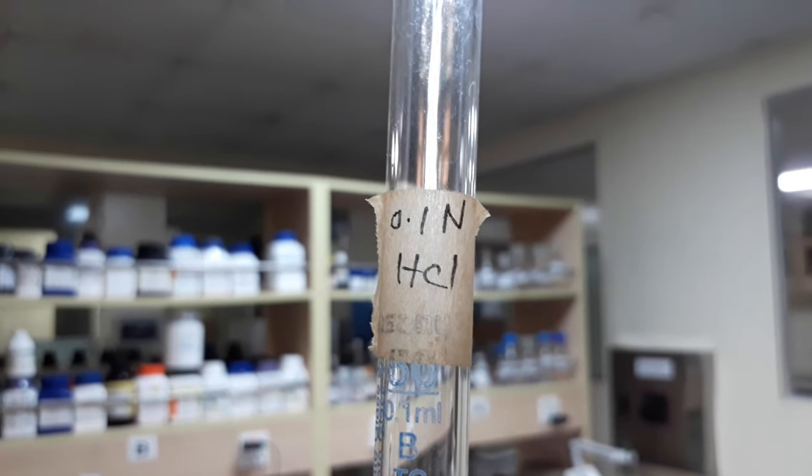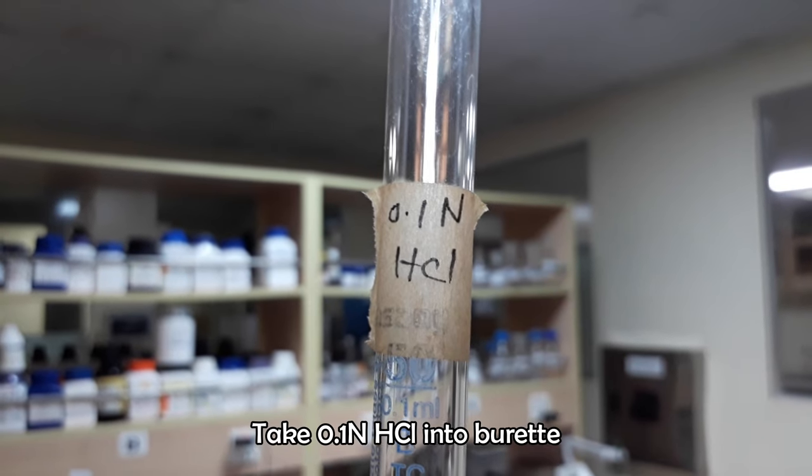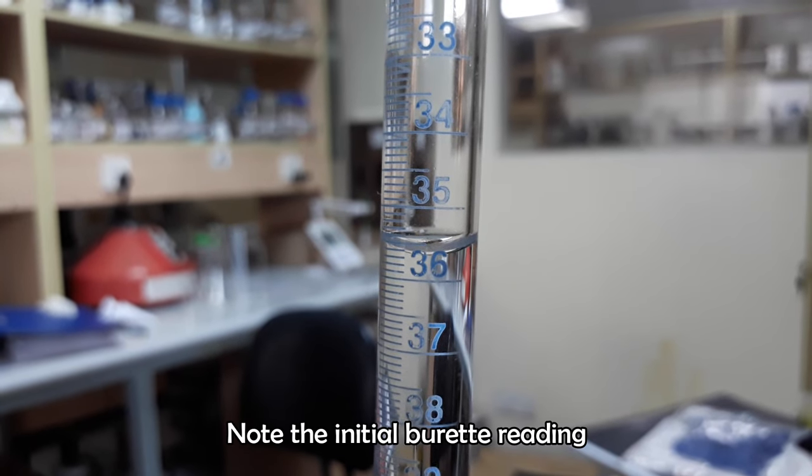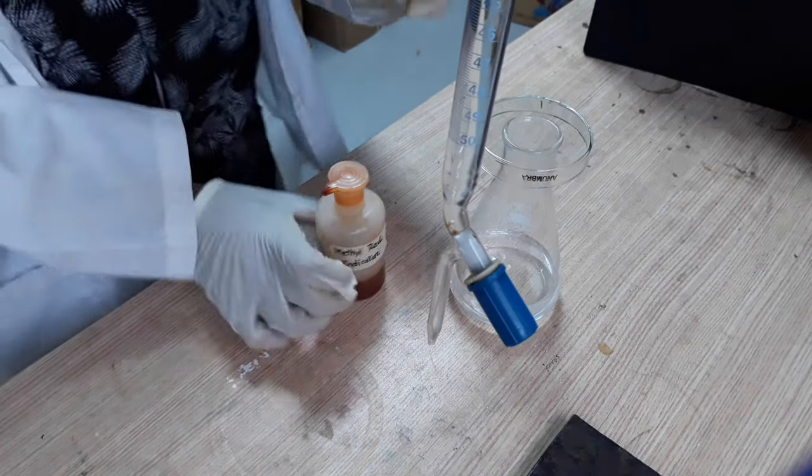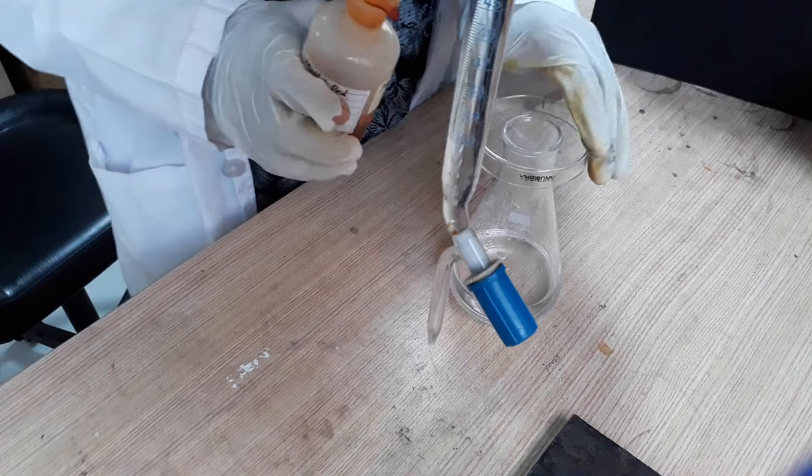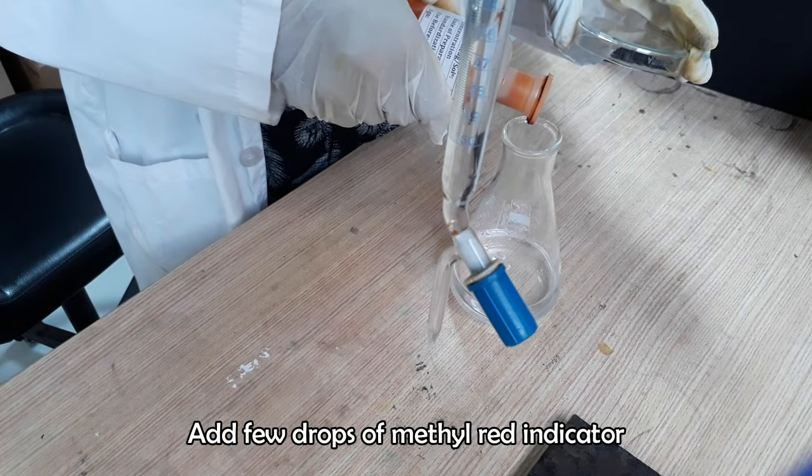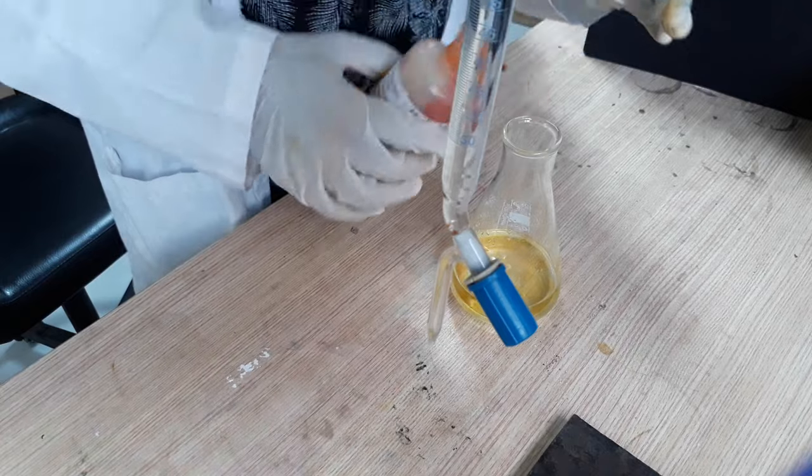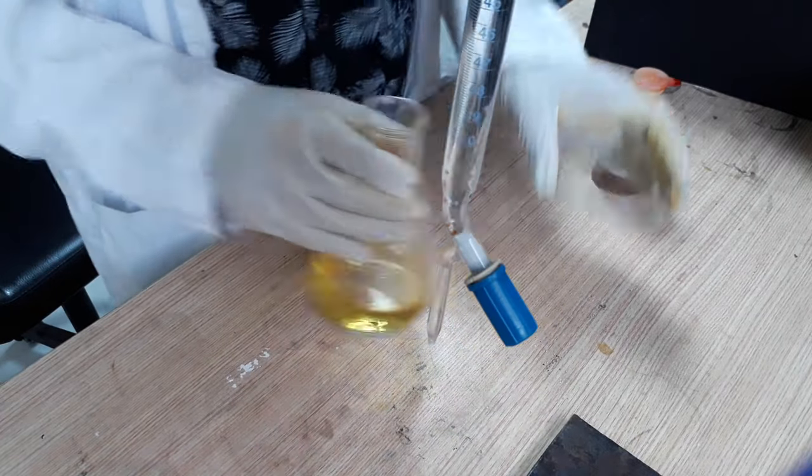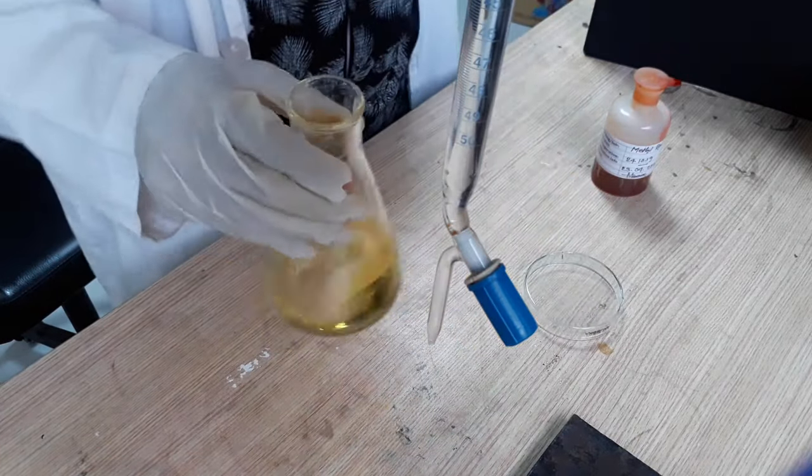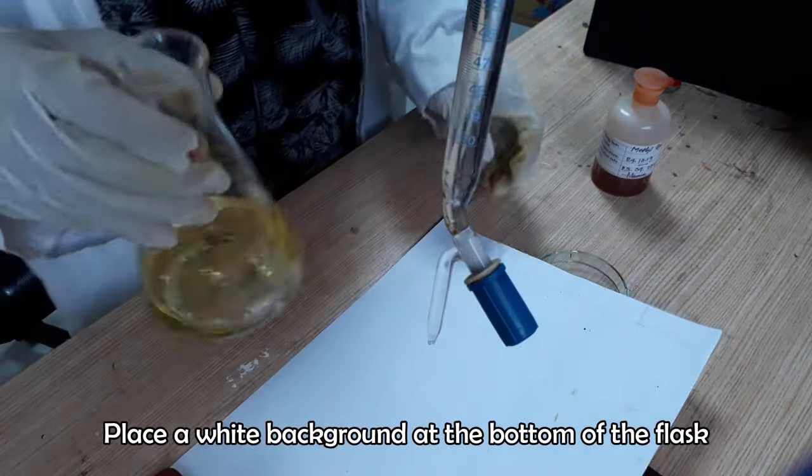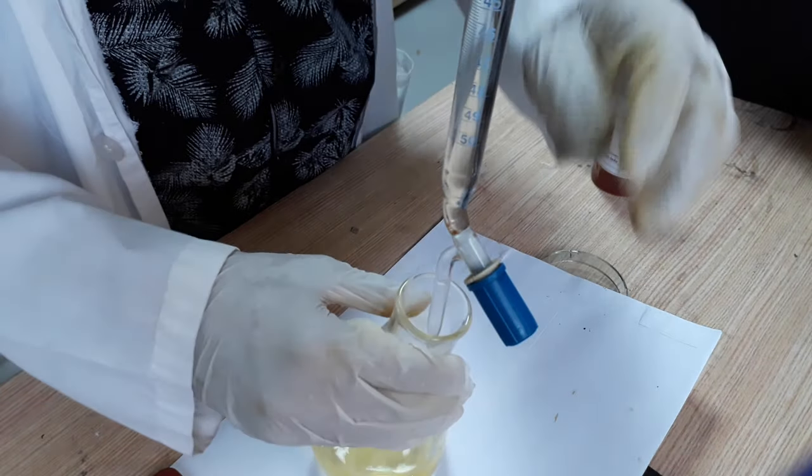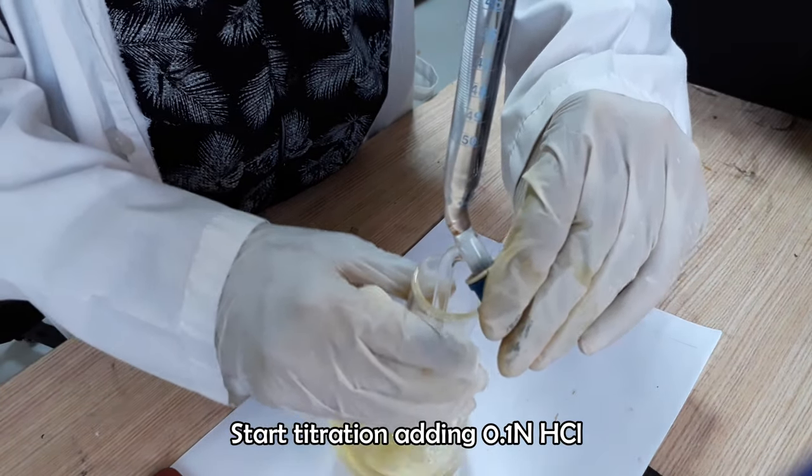Now it's time to do the titration. Take 0.1 normal of standardized hydrochloric acid in burette. Note the initial burette reading. Add few drops of methyl red indicator solution to the conical flask that contains the collected distillate. The color of the distillate will be changed from transparent to yellow. Titrate the distillate with 0.1 normal hydrochloric acid.